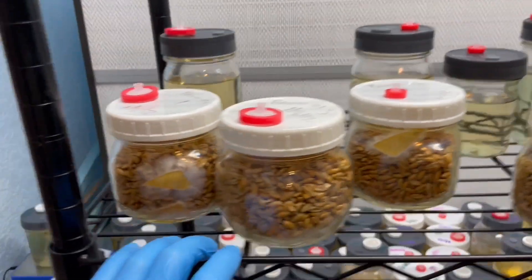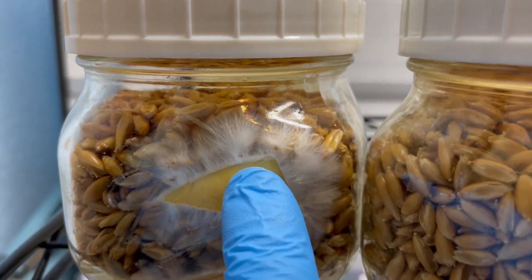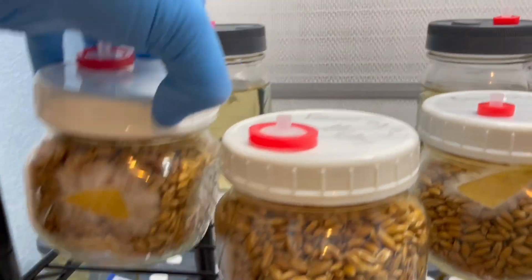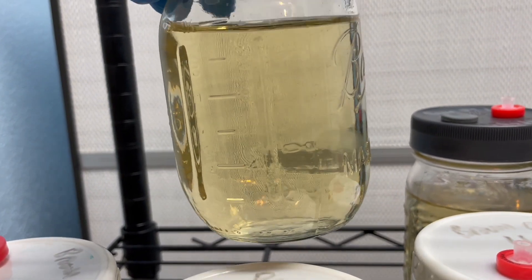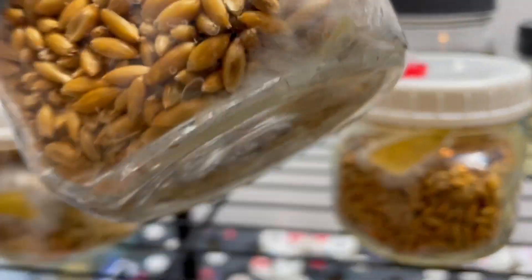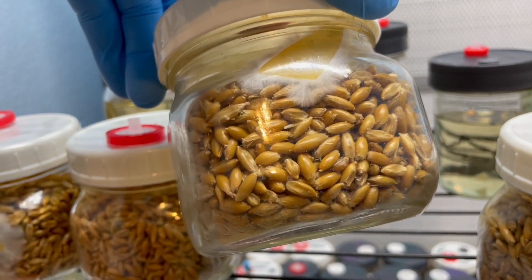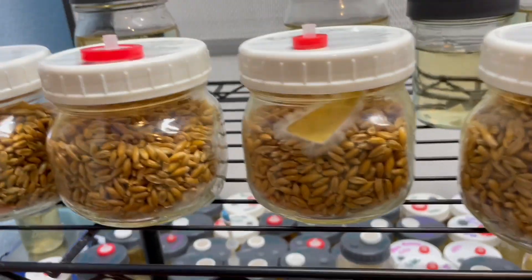Now let's move on to the brown oysters. This one looks really rigorous, vigorous and healthy — this is exactly what we're shooting for. That is brown oyster number one and we've got a nice liquid culture going there, very fast growth. And you can see really nice mycelium.